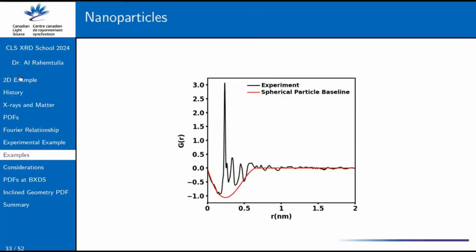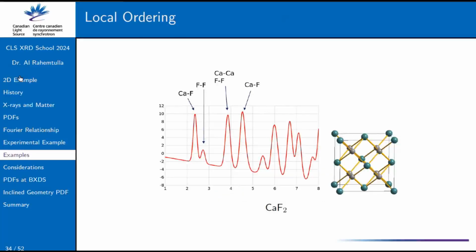So in terms of applications, like I mentioned, we can use this to characterize nanoparticles and nanoparticle size. We can also use it for peak identification and elemental bonding for structure analysis. For a lot of these elements, we know what the bond lengths are.